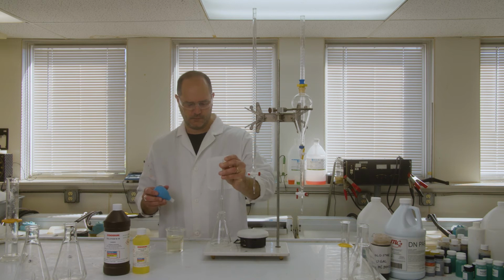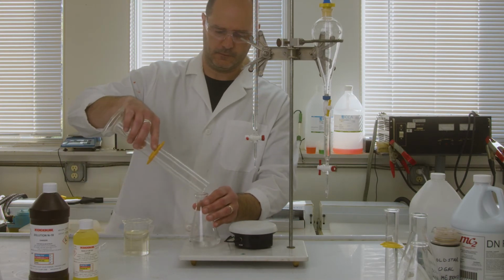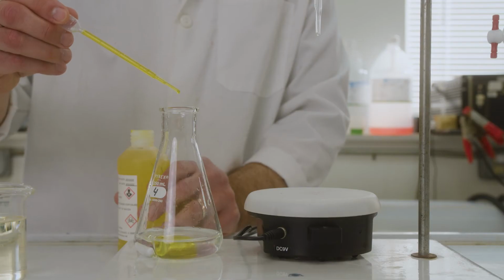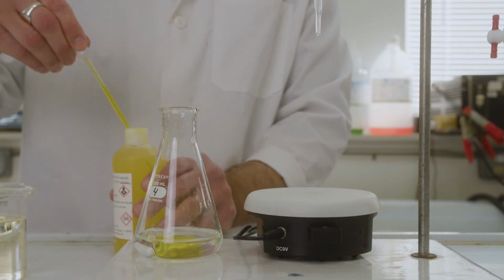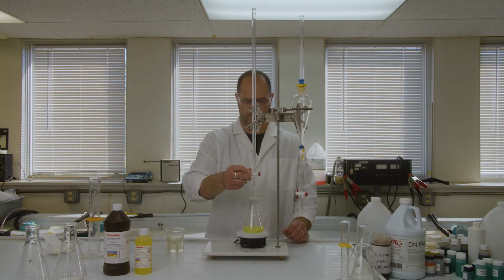Pipette 1 milliliter of the acid chloride zinc process solution into a 250 milliliter Erlenmeyer flask. Add 50 milliliters of deionized water to the flask. Then add 10 drops of Kocher indicator SC and mix the solution. Titrate using Kocher reagent N18 until the solution changes from yellow to orange.